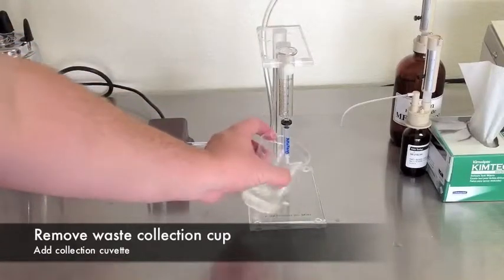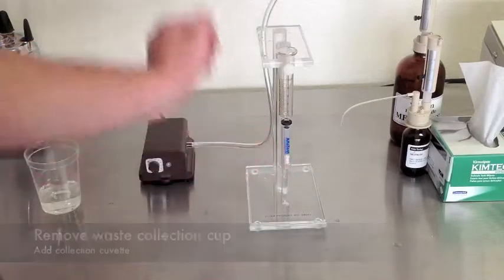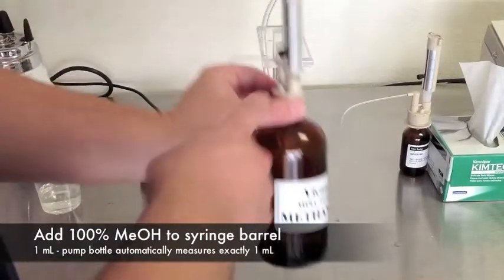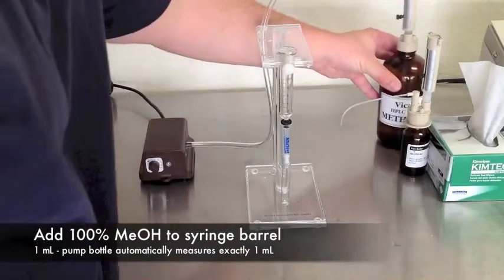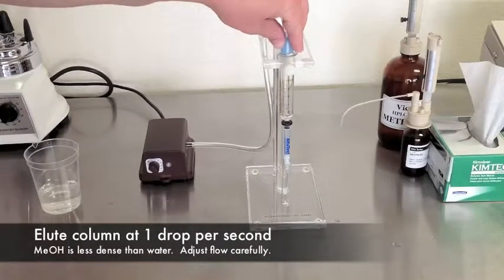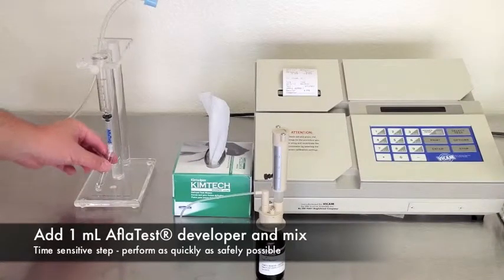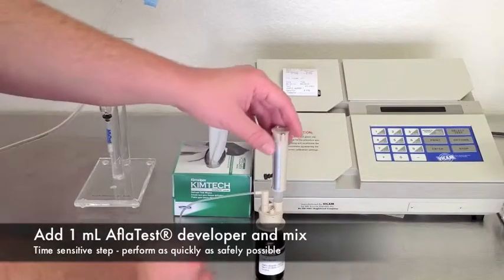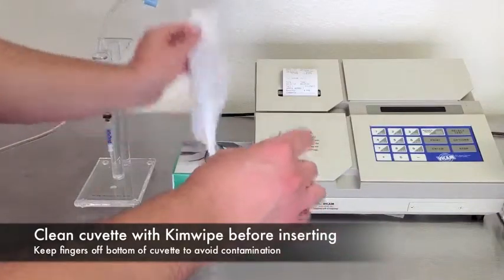Remove the waste collection cup. Place the collection cuvette below the column. Add 1 milliliter of pure methanol. Very carefully pass one drop per second through the column. Methanol is less dense than water, so it will flow quicker than in your last steps. Remove the cuvette. Add 1 milliliter of fresh AFLITest developer solution. Mix. Clean the cuvette with a fresh kim wipe before inserting into the fluorometer.